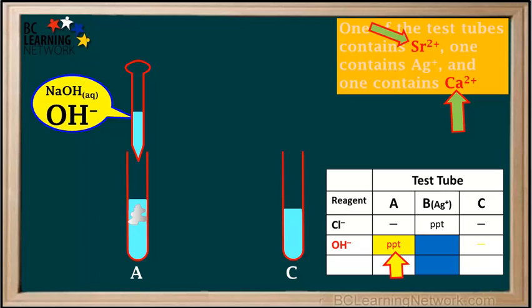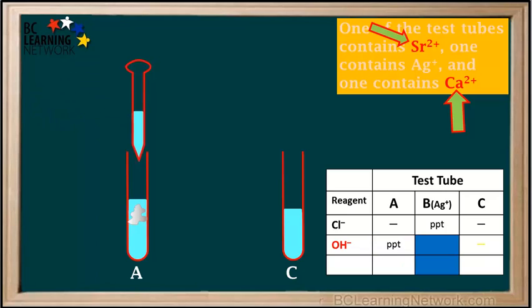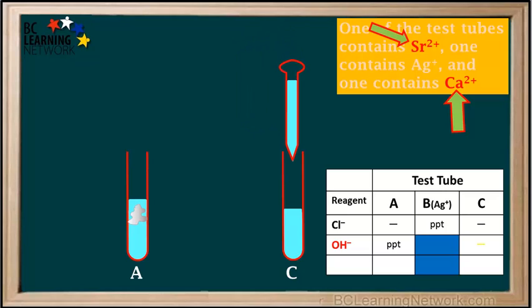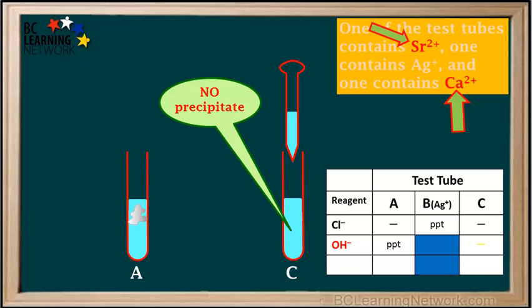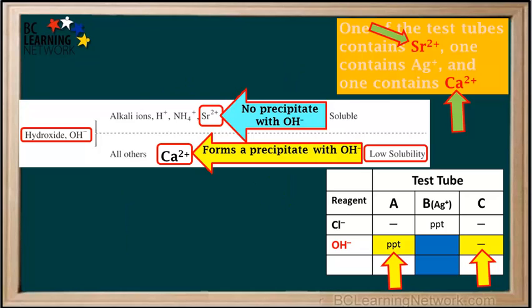Now we'll try hydroxide in test tube C. We remove the pipette, refill it with NaOH, and add the hydroxide solution to test tube C. No precipitate formed when we added hydroxide to test tube C, so we'll add a dash in the cell for OH- in test tube C to indicate no precipitate.